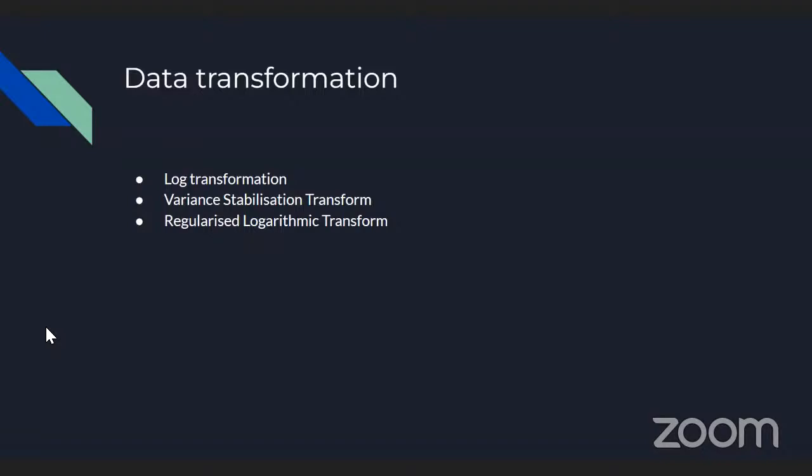So in R, like I said initially, DESeq is a package that we'll be using today to analyze the count data, the data that I have right now. Beyond that, you would want several packages such as dplyr and tidyverse, because I've been using R for some time now, and I do most of my transformations and steps using dplyr and tidyverse commands. So I have to load all of them, and the command to load them is to call the library, and this is how you load it.